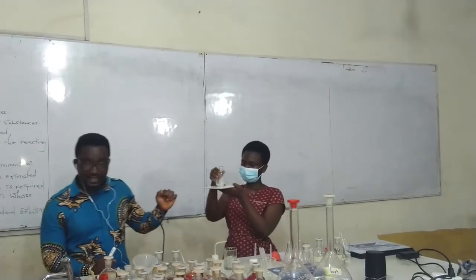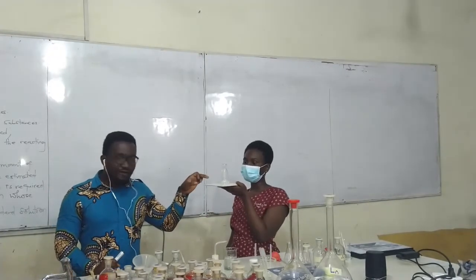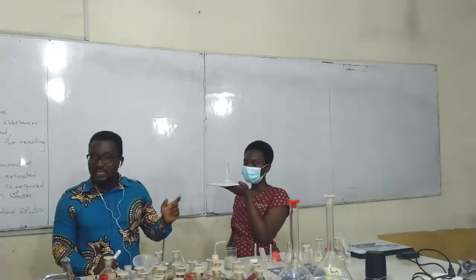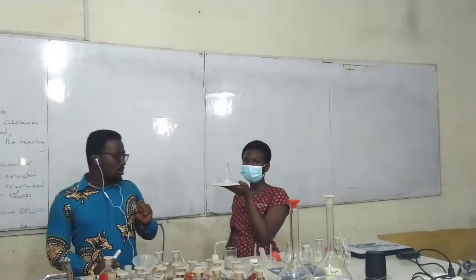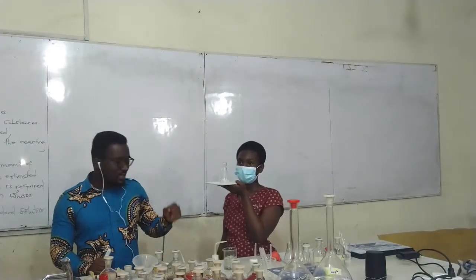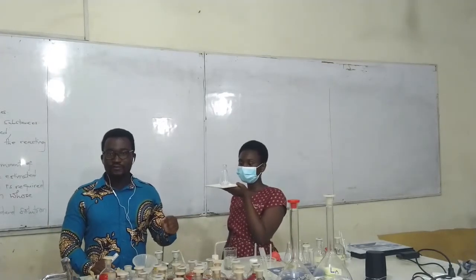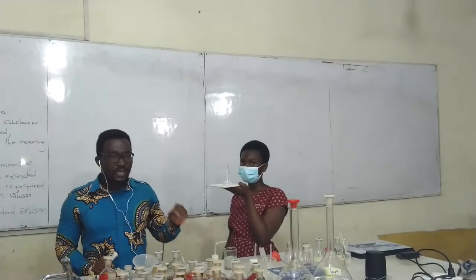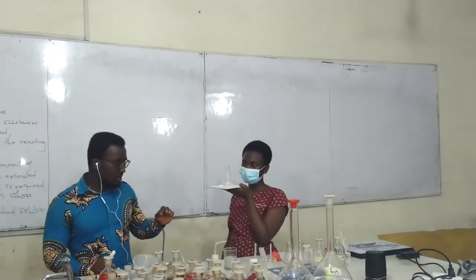Good. So this is solution A. Phenolphthalein was placed in here. We realized that the nature of phenolphthalein in here was colorless. Therefore, this also reveals or confirms that solution A is acidic. Why? From theory, we know that phenolphthalein in acidic solution is colorless. That is the confirmation.